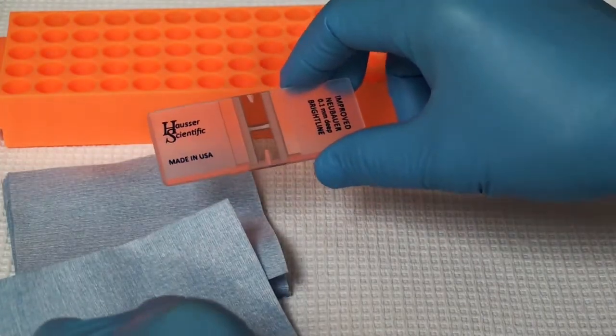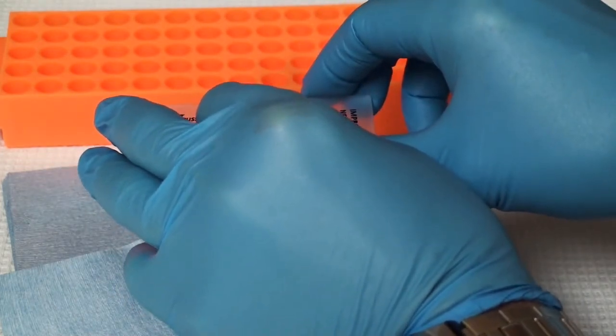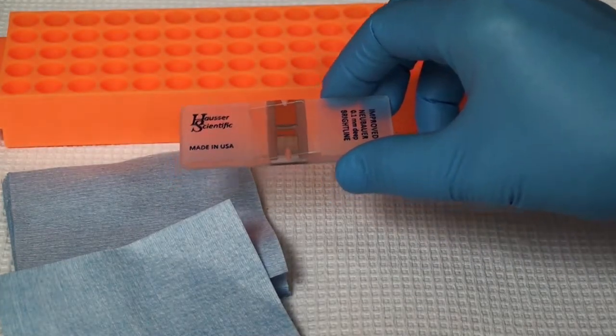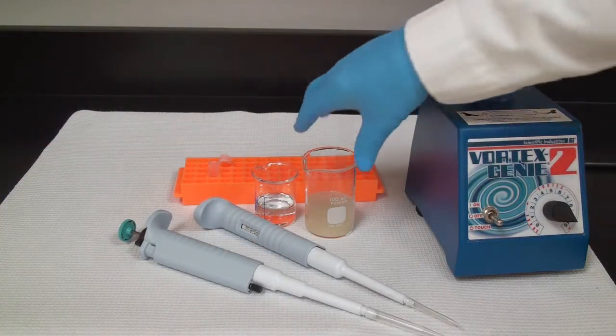Now that we have that cleaned, our coverslip goes right on top. Again, this is a special coverslip, so don't use a regular coverslip that you use for light microscopy. Now let's dilute our samples and then load it.